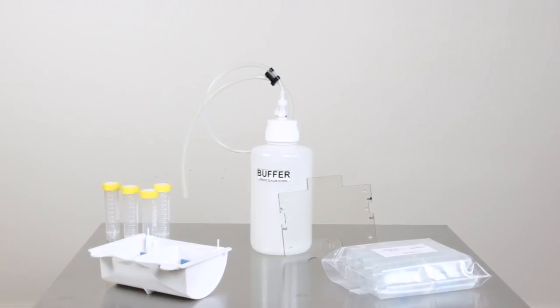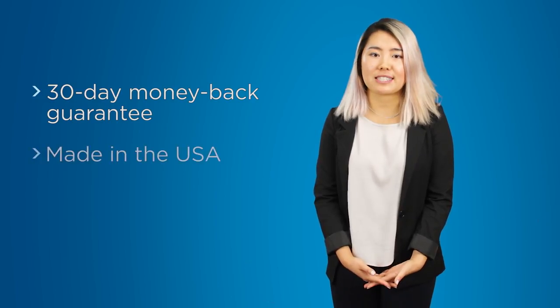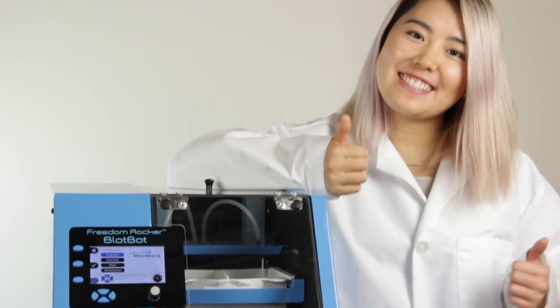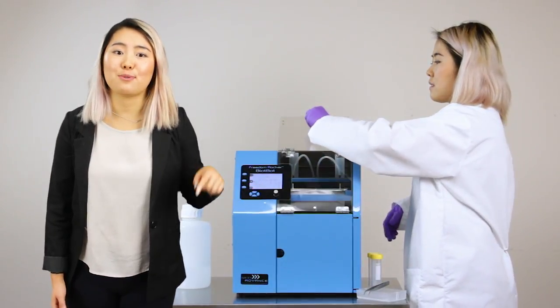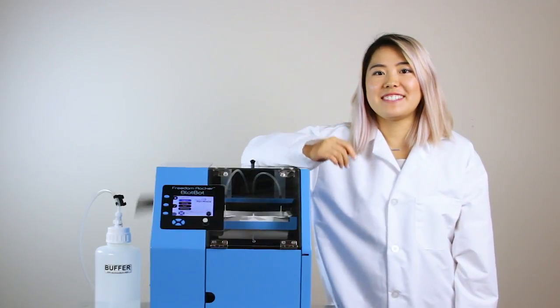Don't believe the BlotBot will really make you that much more productive? Go and try it, risk-free. Everything you need is included, so you'll be ready to go right out of the box. The BlotBot comes with NexAdvance's 30-day money-back guarantee, as well as a full two-year warranty. Original Freedom Rocker units from 2005 are still in use today. Email us at sales@nextadvance.com for more information, and throw out your timer.